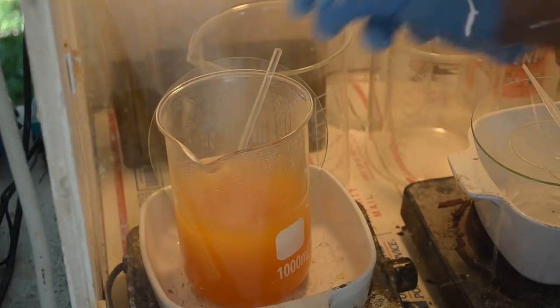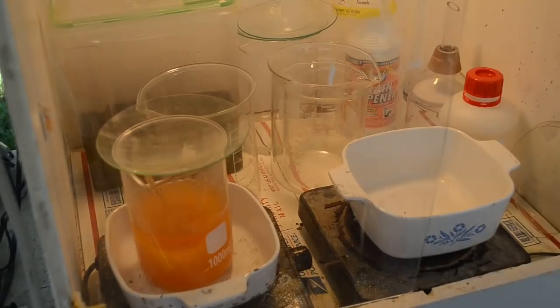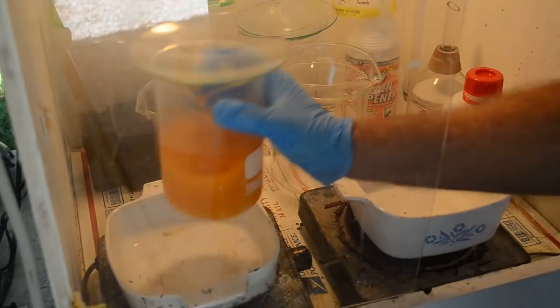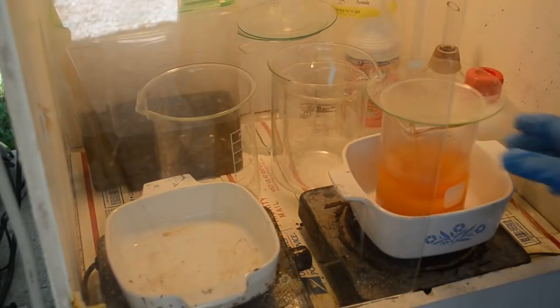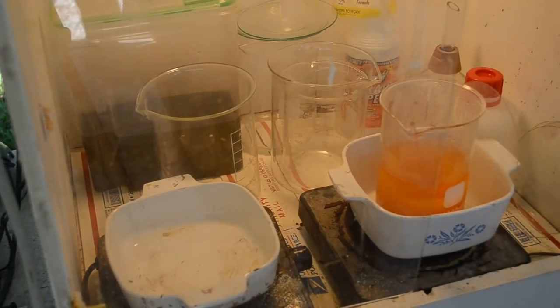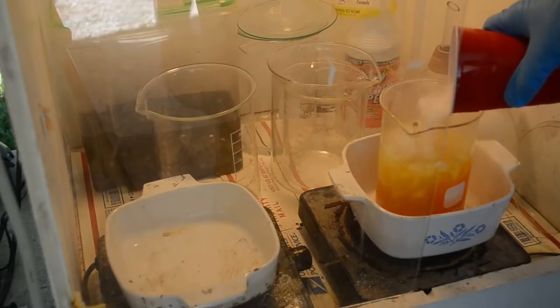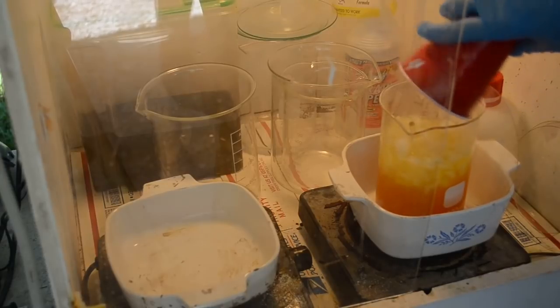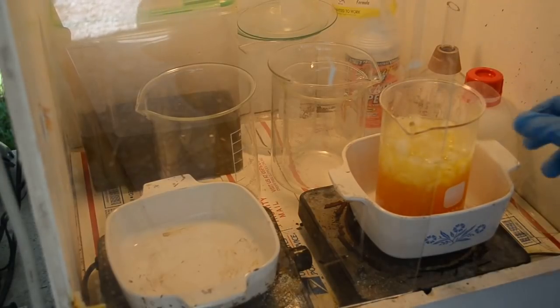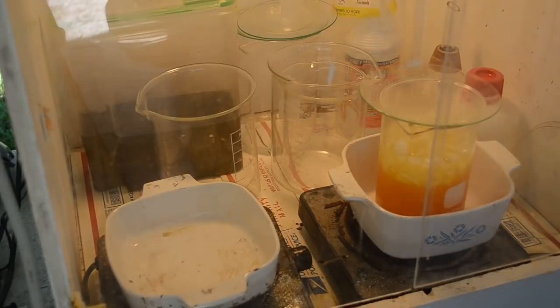Put a little more in just to be on the safe side. And I gotta go get some ice. We'll ice it down, cool it off, and then filter it. Okay, let me take this off of the hot plate. I turned it off a while ago, but it's still quite warm. We don't need the heat right now because it's time to ice it down and cool it off. Okay, we'll let that ice melt and I will set up the filtration apparatus.